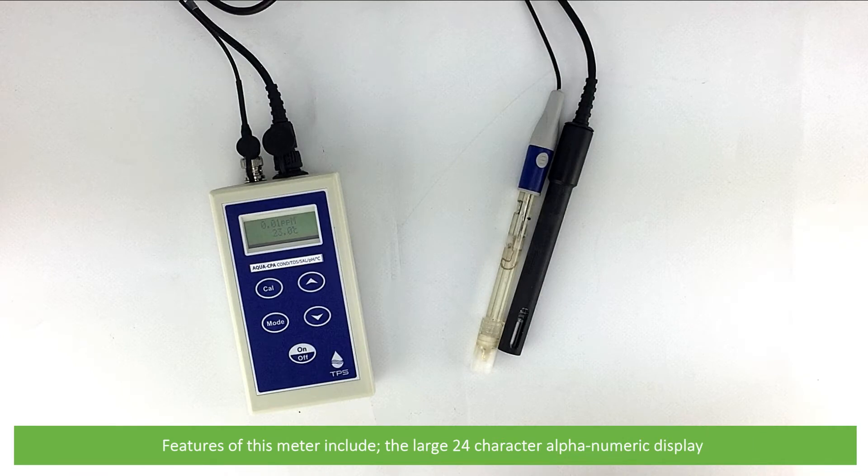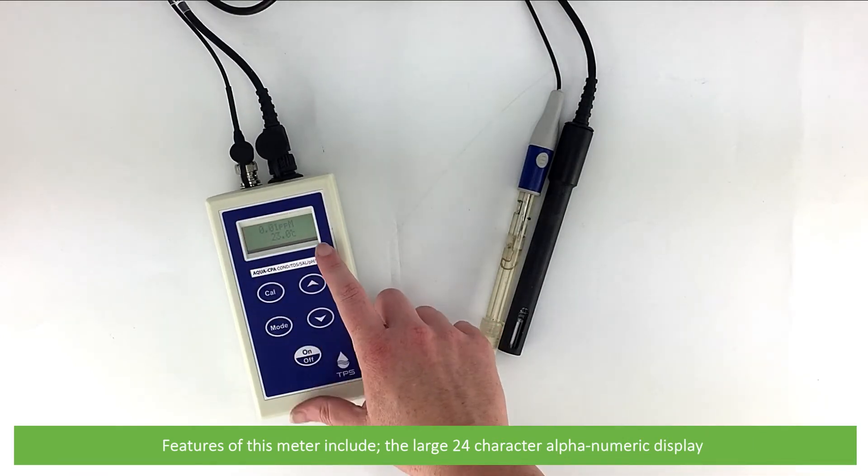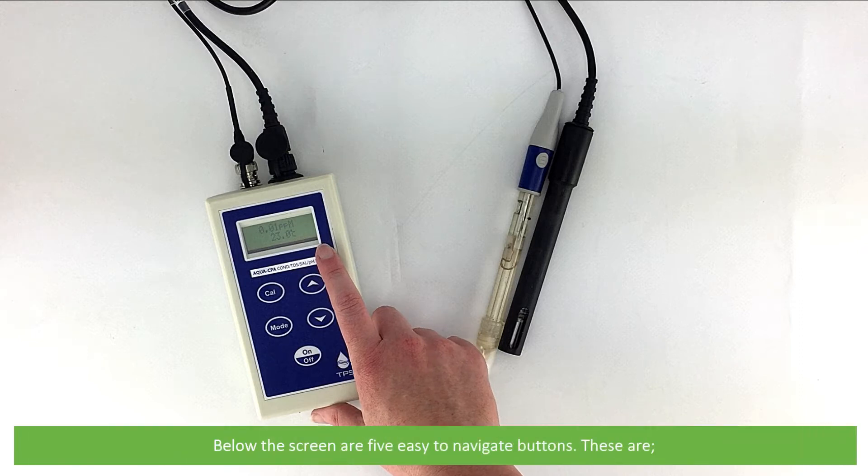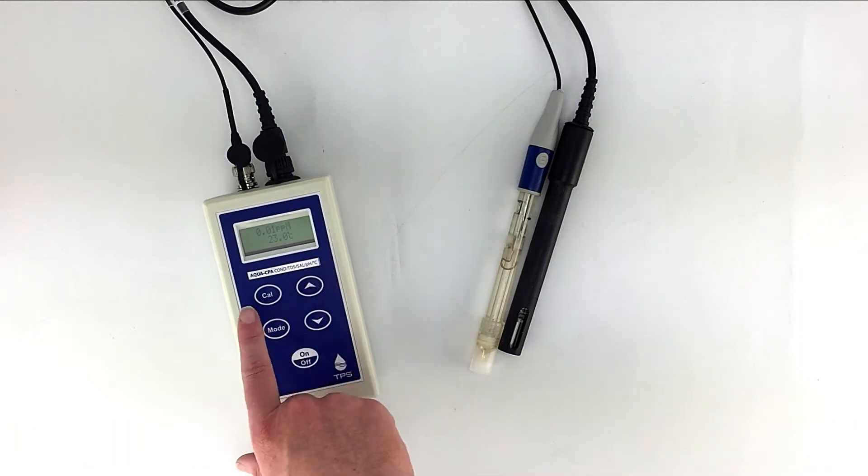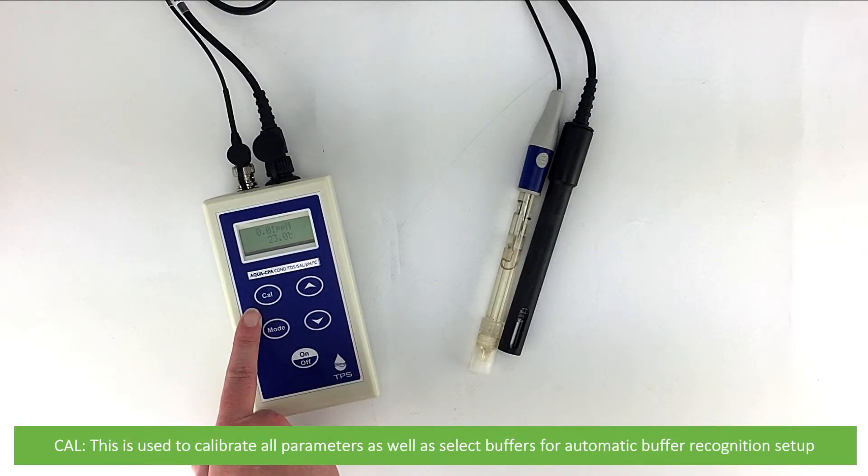Features of this meter include the large 24 character alphanumeric display. Below the screen are five easy to navigate buttons. These are Cal, which is used to calibrate all parameters as well as select buffers for automatic buffer recognition setup.